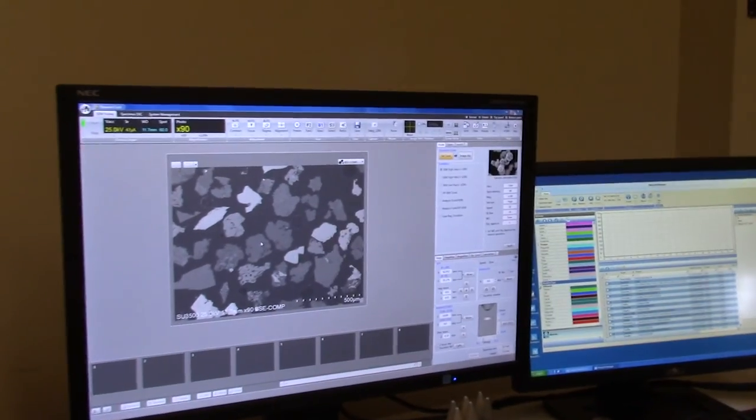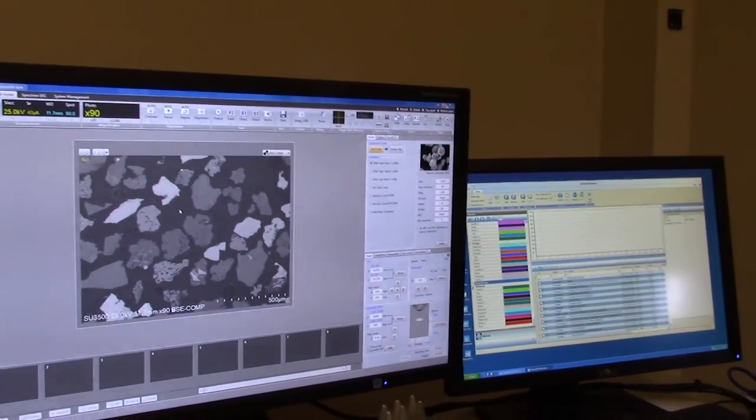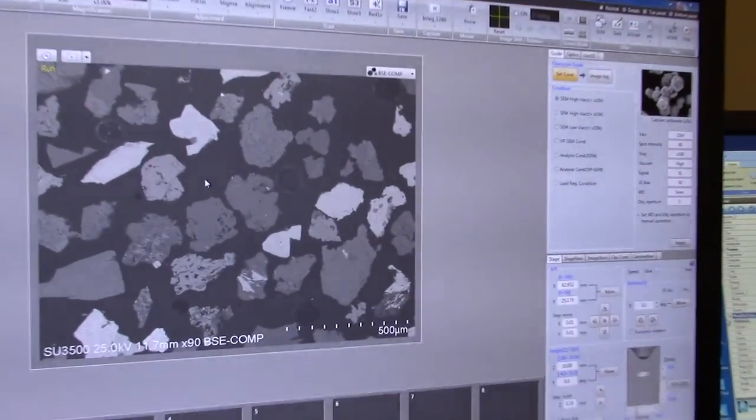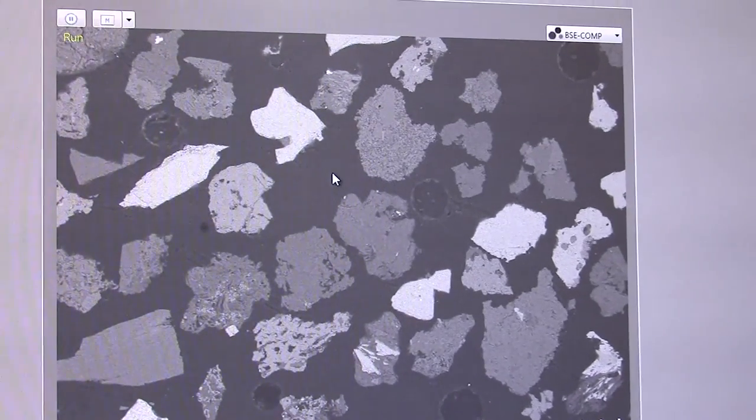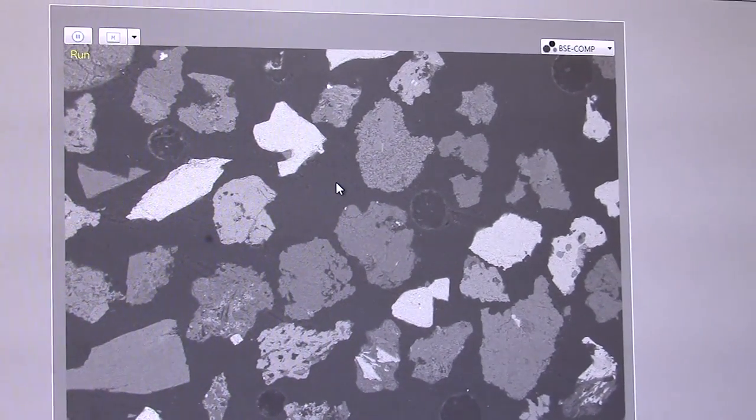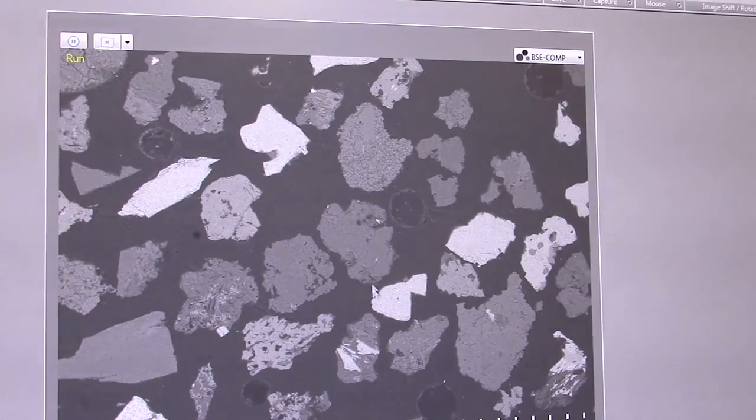What we have is something called a backscatter image. Everything is black right here because it's carbon coated, and you need carbon in order to run the SEM with these high voltages and high vacuums. The rule of thumb is black is carbon.